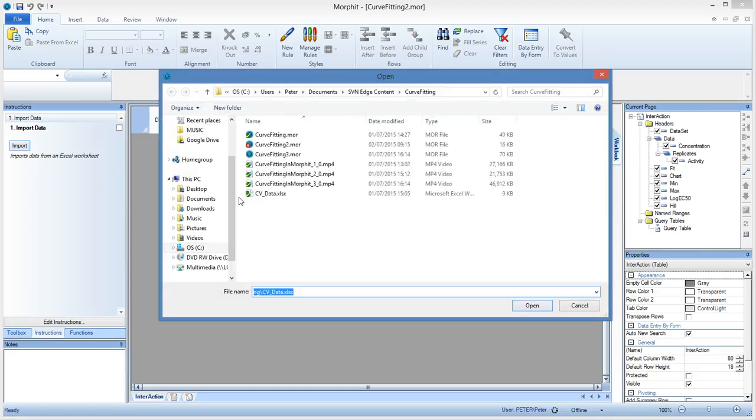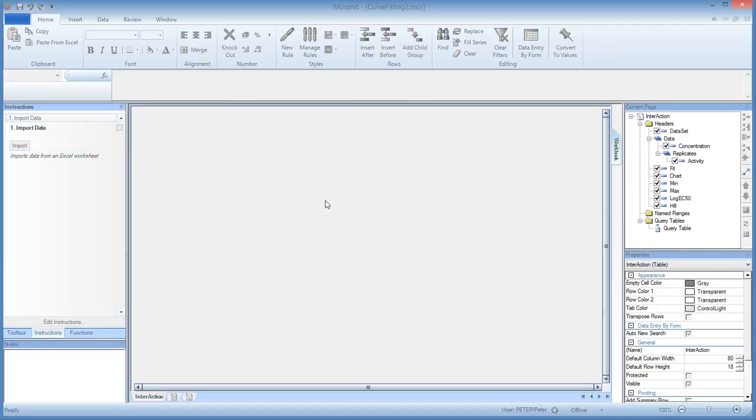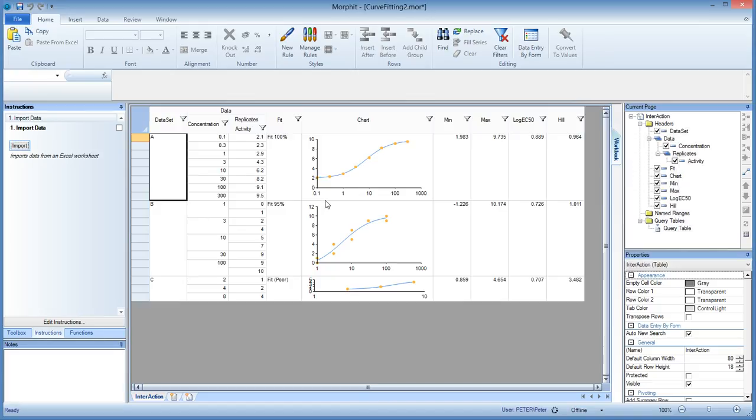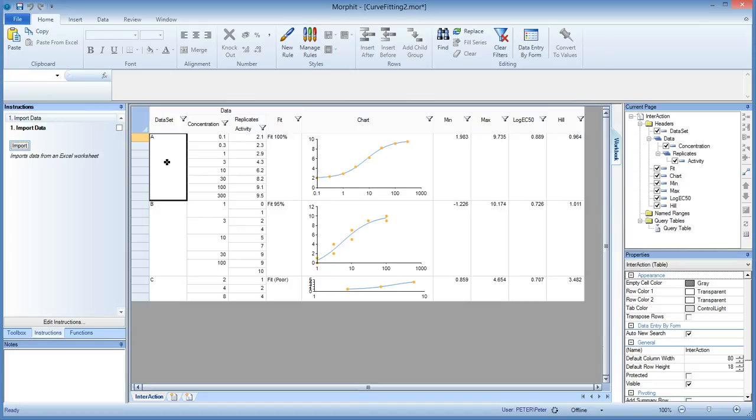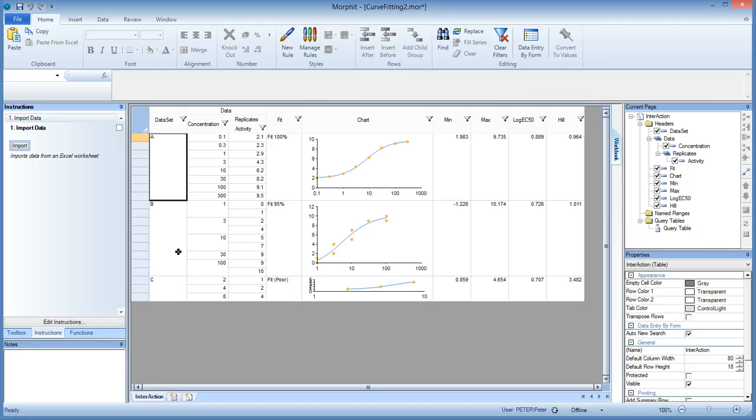So let's bring in the data. We can point to one or multiple XLS files. So this is the one we created. So it contains three data sets and it has done all the work for us but it starts with reading the data set, the concentration and the activity columns so it brings in the data and Morfit scales automatically to the data it finds.